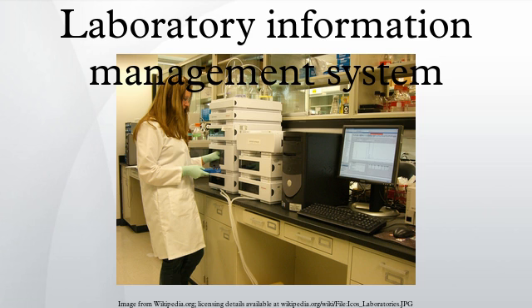Electronic data exchange. The exponentially growing volume of data created in laboratories, coupled with increased business demands and focus on profitability, have pushed LIMS vendors to increase attention to how their LIMS handles electronic data exchanges. Attention must be paid to how an instrument's input and output data is managed, how remote sample collection data is imported and exported, and how mobile technology integrates with the LIMS. The successful transfer of data files in Microsoft Excel and other formats, as well as the import and export of data to Oracle, SQL, and Microsoft Access databases is a pivotal aspect of the modern LIMS.